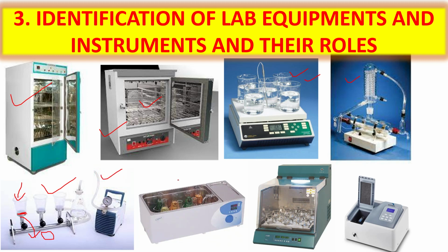Another equipment which is used is the water bath. So water bath is used to keep the solution or any media at under 100 degrees Celsius for 15 minutes or half hour or 1 hour. Okay, so next one is the shaker incubator.